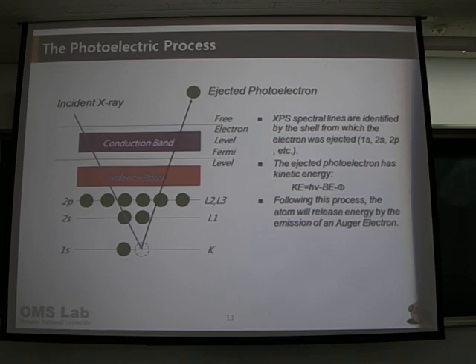So can I say that work function depends on the material? Each material has a different work function. In the case of core electrons, when the beam is incident, going from the core to the solid surface there is some work done. Every material has its own work needed to take this electron from the core to the surface.